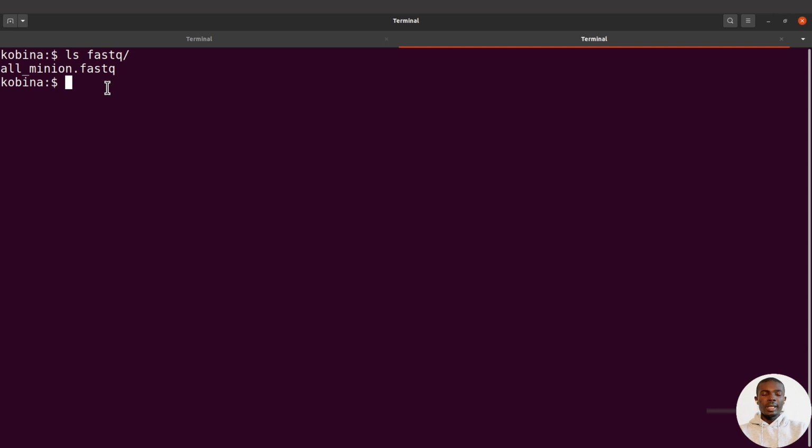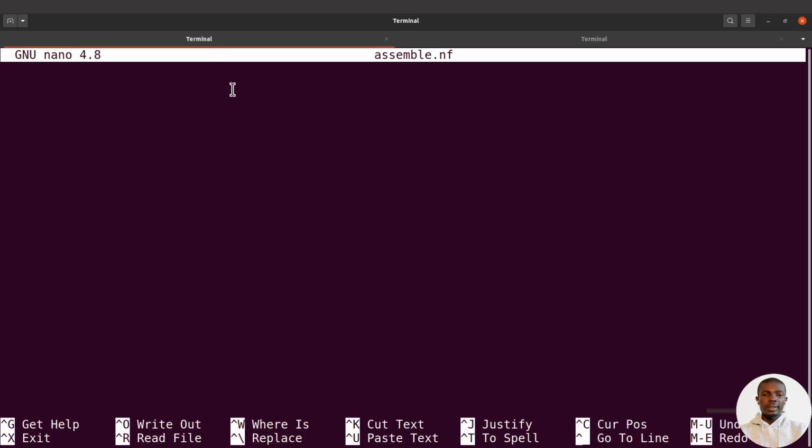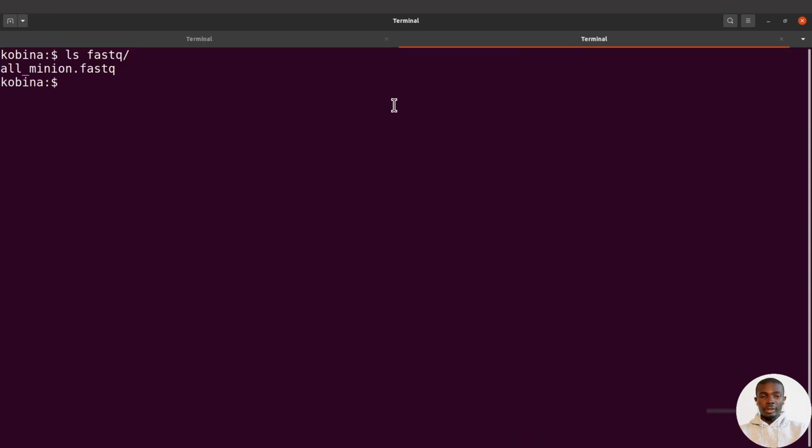Nextflow will take these commands and use them to get the necessary information and files. So I'm going to supply Nextflow with the directory which has the files. Whatever we are going to use, you can apply it if you have multiple files or multiple samples. Even though I'm using just a single file or sample here, you can use the same approach for multiple files.